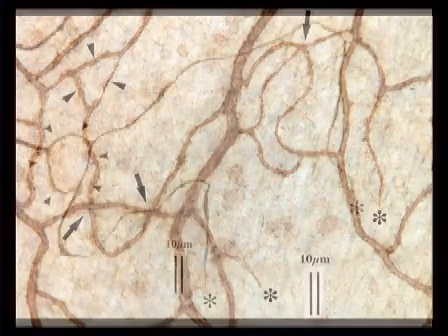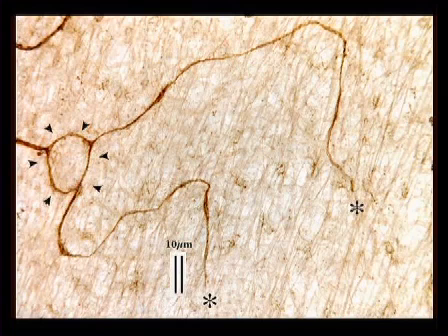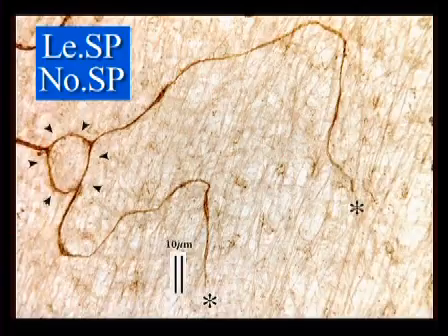Using similar techniques at the periphery of the microvessel network, we are able also to quantify corresponding variables for microvessel sprouts, including length of sprouts, LESP, and number of sprouts per unit tissue volume, NOSP.